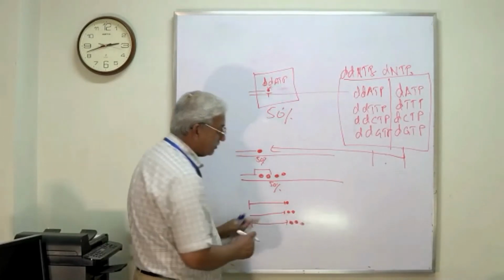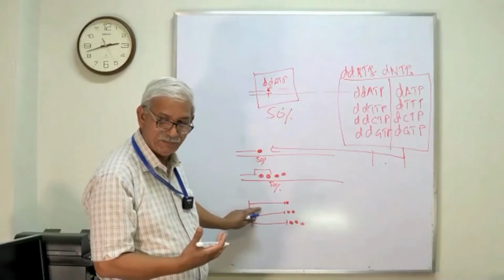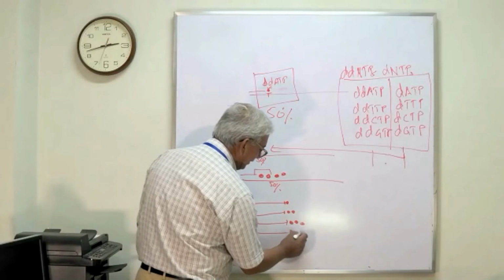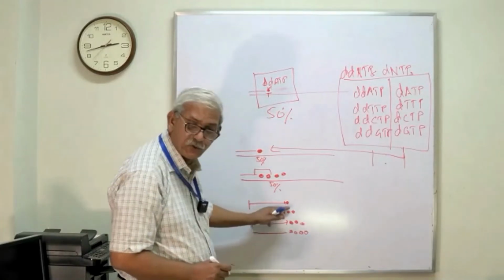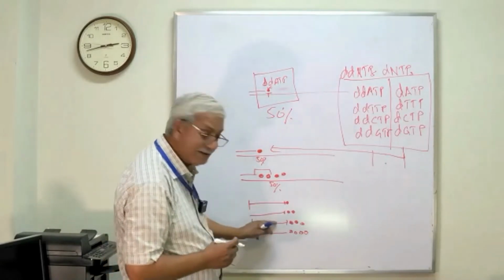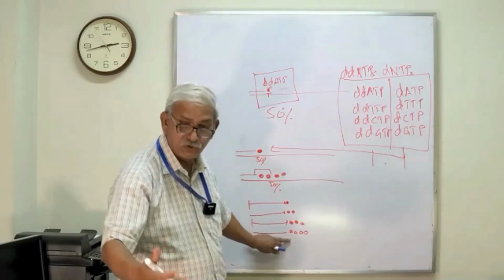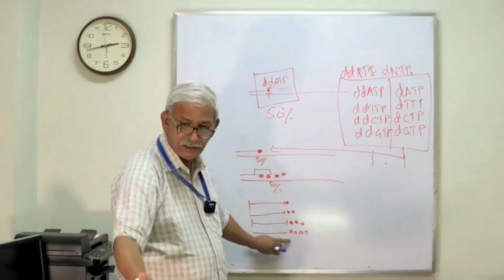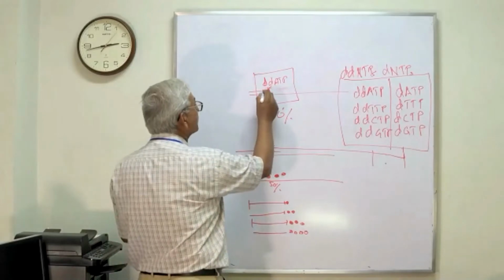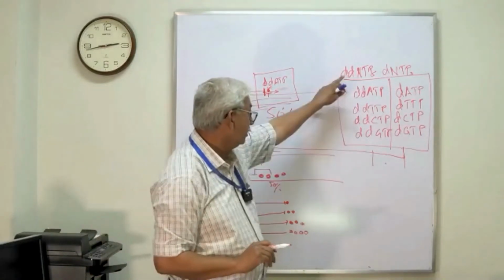Because there are equal concentrations of the two, most of the end products, meaning the fragments which we will get, will have only a few nucleotides added to them when the chain has been terminated. So we get just short fragments, and we will read the sequence very close to the primer. When such fragments are generated with only a few nucleotides added, even 10 or 15, we are reading only the first 15 nucleotides closest to the primer sequence. Short fragments are obtained if we have equal concentration.